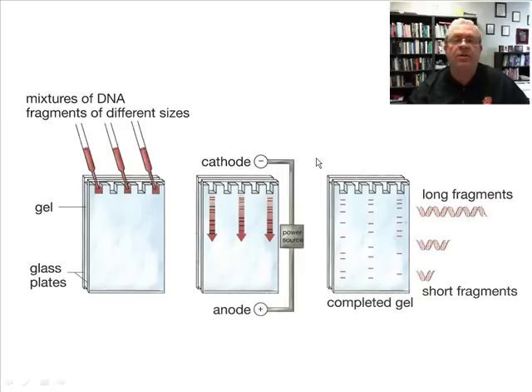And so, how does it work? Well, first of all, as we've said earlier, when DNA is compared with DNA, you don't use all 6 feet. The people that do this just use very short sections known to be different from person to person. They take a bunch of those short sections, chop them up and spread them out on a gel. And so the pattern that's formed is unique to a particular individual, at least when you put all the patterns together.